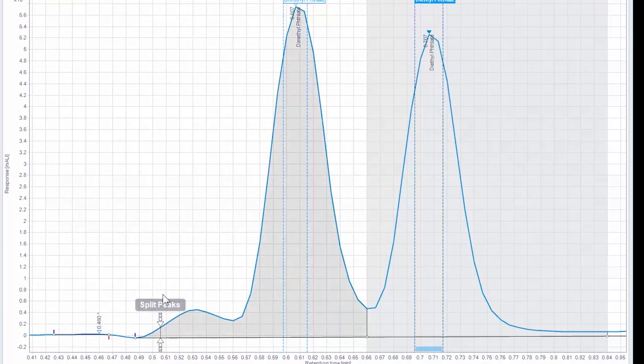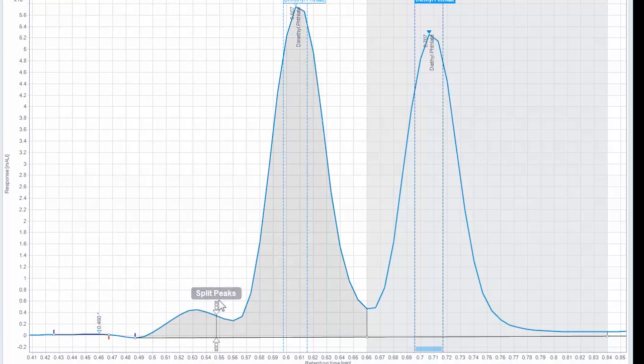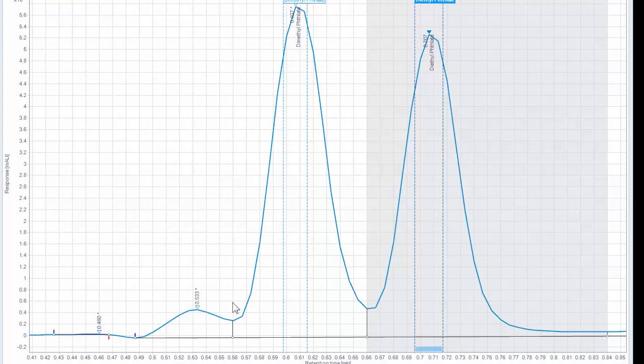To split a peak, hover just above your trace where a peak has already been identified. Click the retention time where you would like to split your peak.